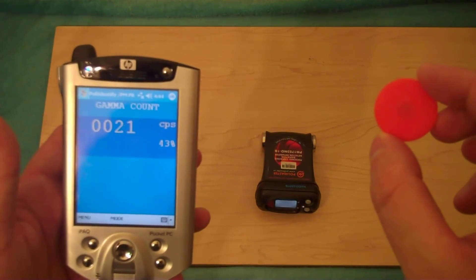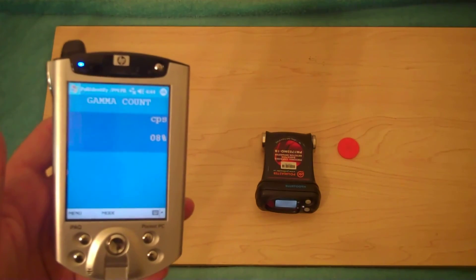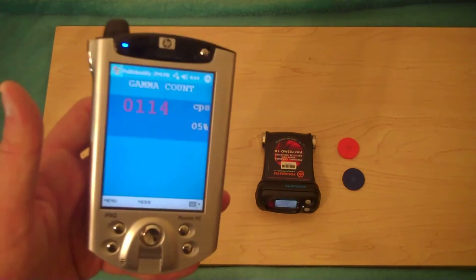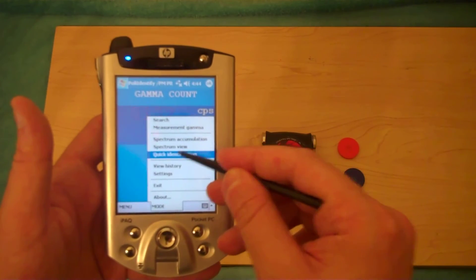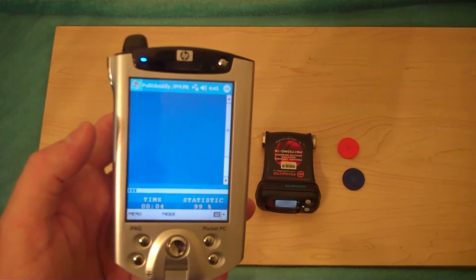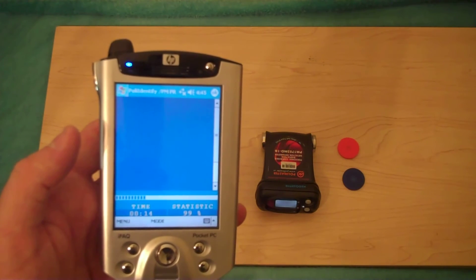Now let's say you had two common industrial isotope samples and wanted to find out which one was which. It would probably be better to put them in one at a time, but let's be tougher on the machine and put them both in to see if it can figure out what they are. Let's say you start working at a new college or university and find old samples in the back of your office with the stickers worn off — someone didn't document them correctly. This should only take a minute because these are pretty hot, around 37 kBq each. The orange one is more like 33 kBq but actually higher in energy.